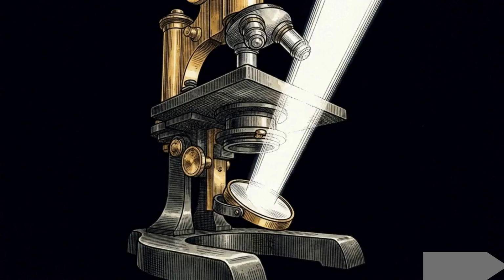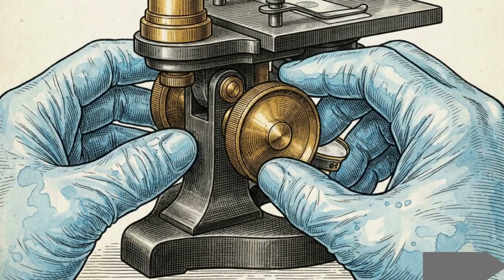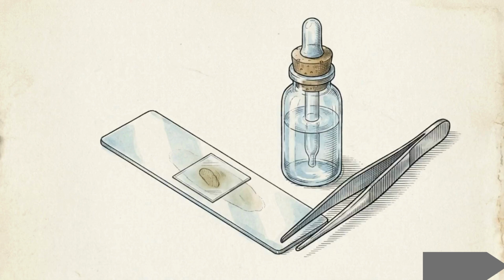The light microscope is the primary tool for this investigation. Operating it effectively requires a specific sequence of masterable physical skills. The investigation begins with the shift from viewing diagrams to physically preparing a specimen for measurement.